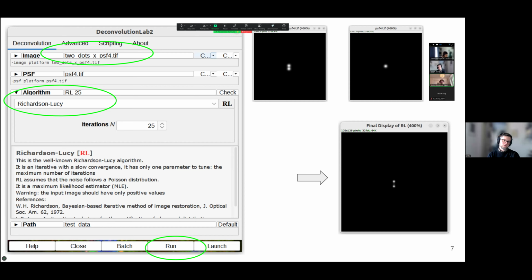Yeah, I don't know what they use. That's trade secrets, I would guess. But for sure, I remember that they process the images in tiles in some way. And they probably have a lot of clever tricks, having invested a lot of development time into it. And if you compare them, you will also see that Huygens is much quicker than DeconvolutionLab2.